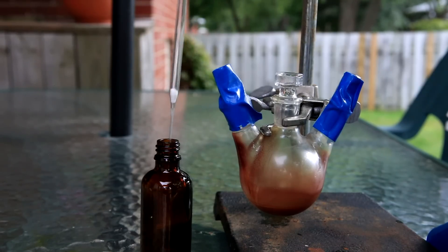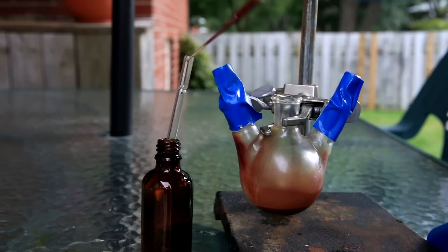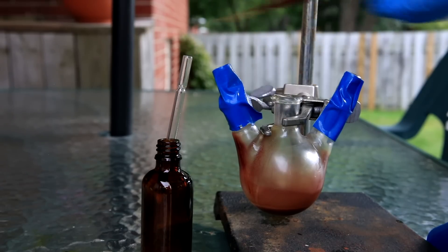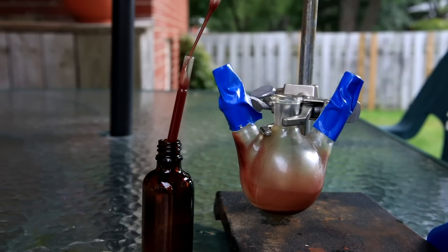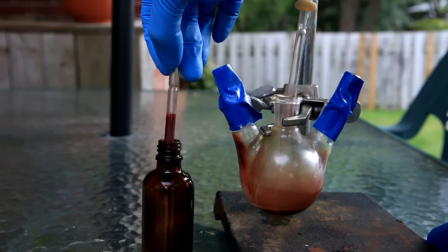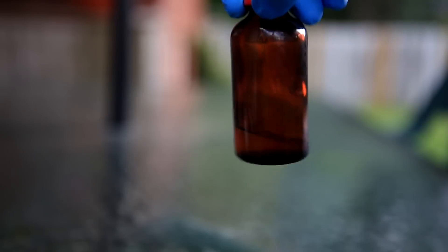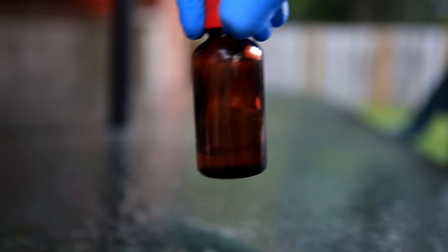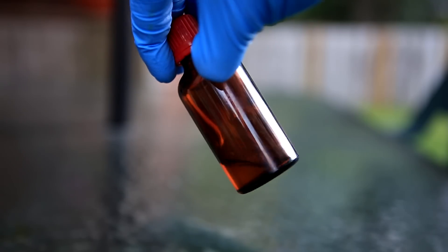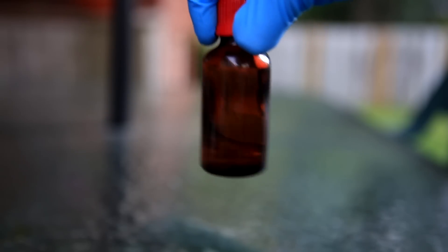To clean up the silicon tetrachloride I passed it all through a pipette with cotton at the bottom. I'm not exactly sure what the red particulate in suspension is, but it can be removed by filtration. You can see that when the pipette is lifted it's a clear solution dripping out the bottom. Occasionally I used the pipette bulb to apply some pressure. In the end I'm left with a nice clear silicon tetrachloride. Note that in the bottle it starts to become a little cloudy because it reacts with water in the air and forms silicon dioxide.